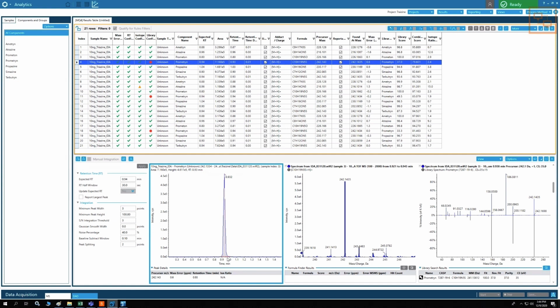So it's not like there was another mass at a different retention time. So where did that 186 come from? How did it get there? We didn't talk about SWATH in detail, but if this was SWATH data, it would kind of make sense, right? Because maybe the 186 came from another parent. But this is not SWATH data, this is IDA. So the answer is in the chart.